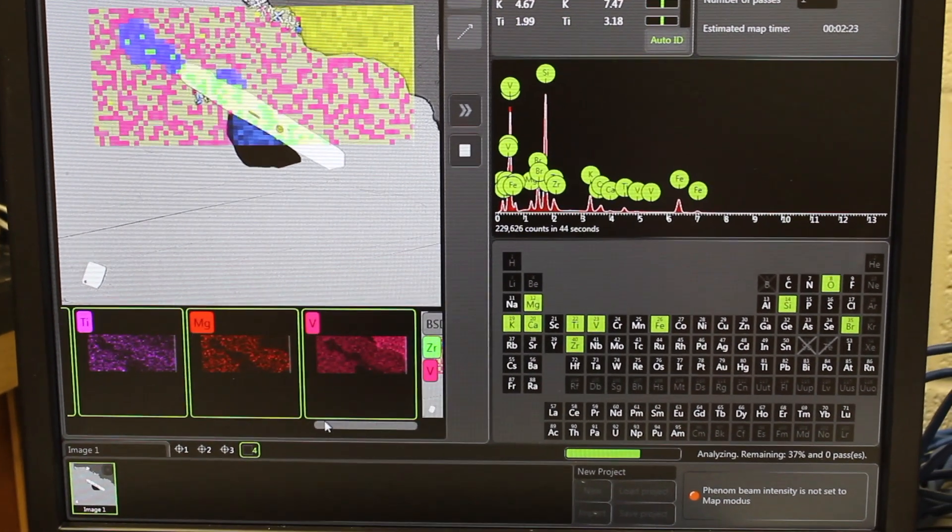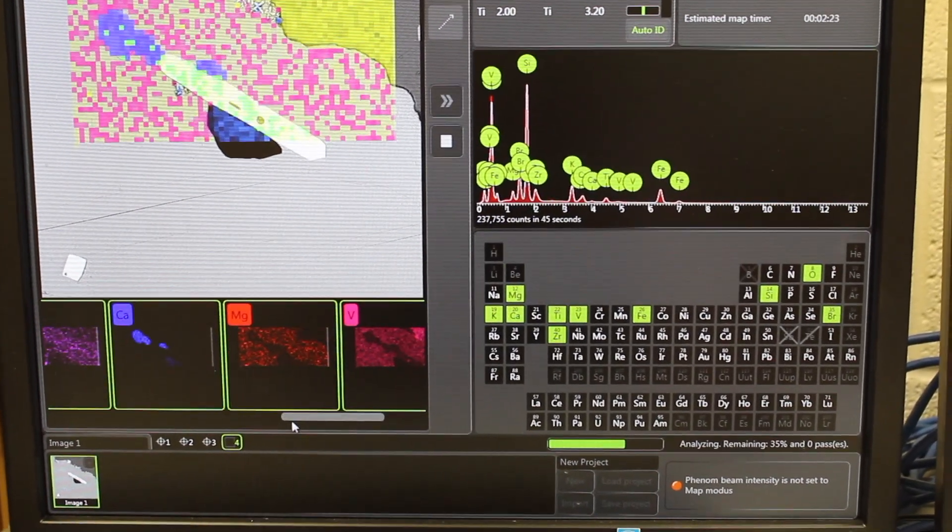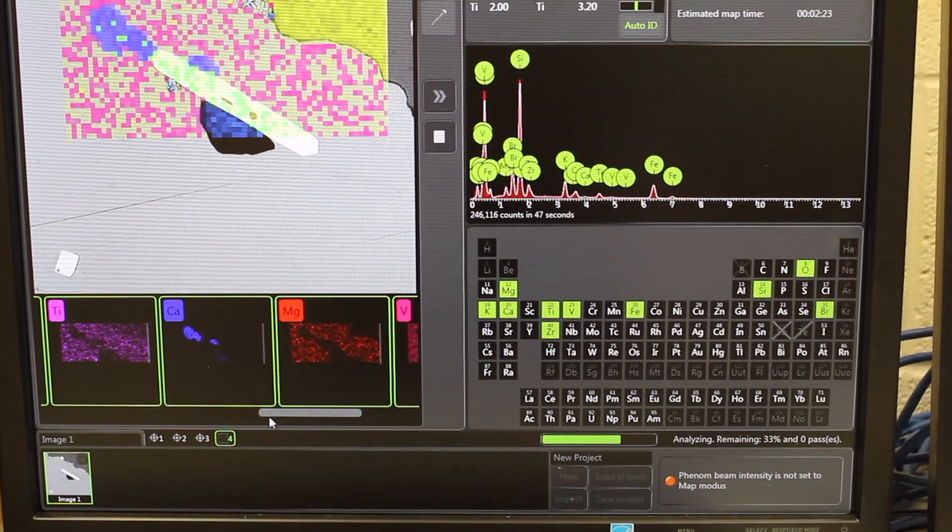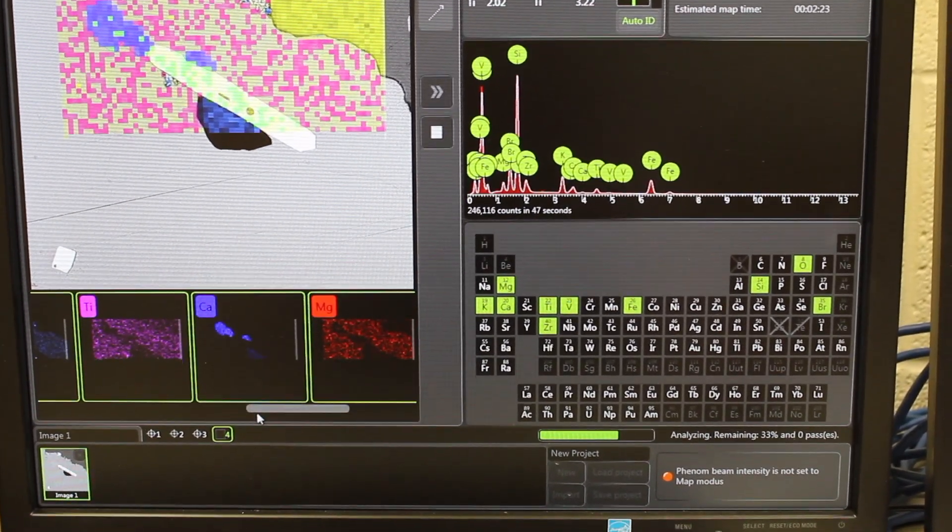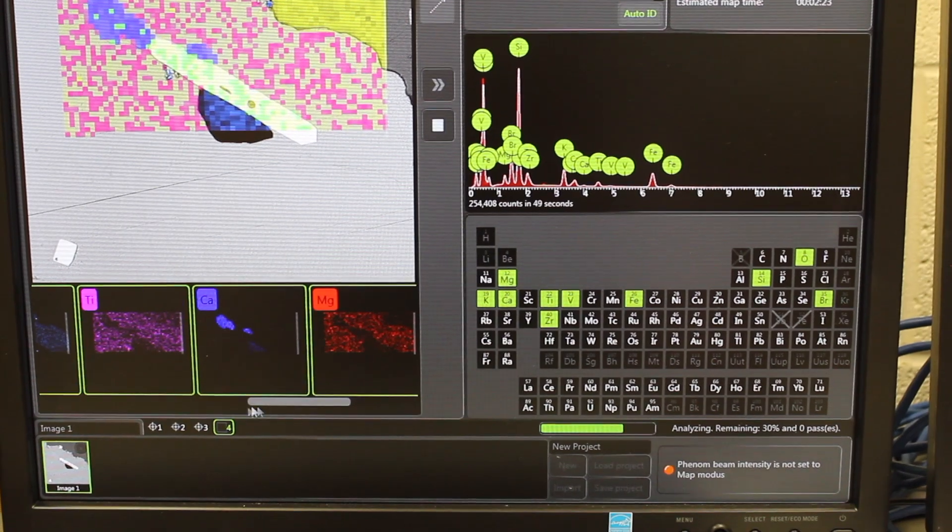But it's really pretty interesting because you can see zoning in different minerals very clearly with some of these element maps.